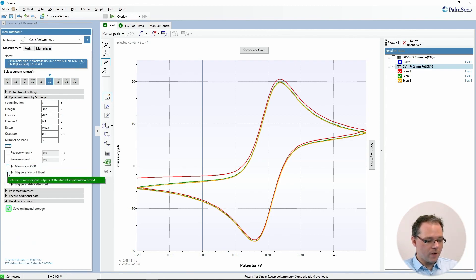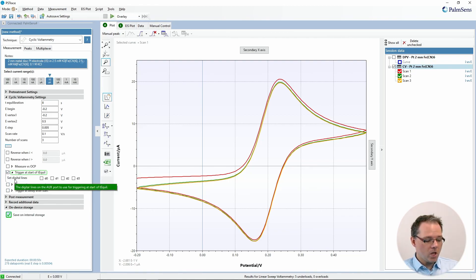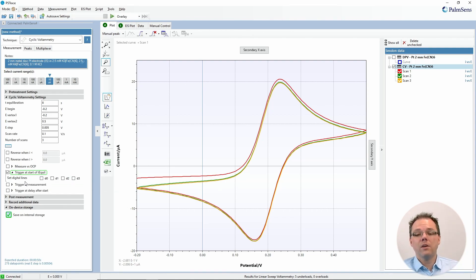You can also set various triggers at certain points of the measurement. These triggers set the digital lines from the auxiliary port of your potentiostat to certain values, allowing you to communicate with other devices. For example, if you have a flow system and want to start the flow when the measurement begins, you could send your pump a signal to start at that point.